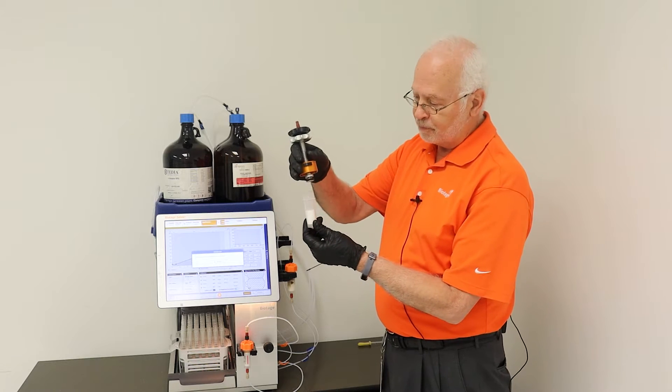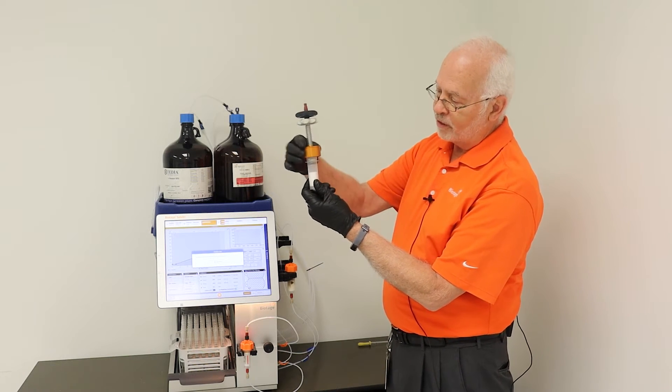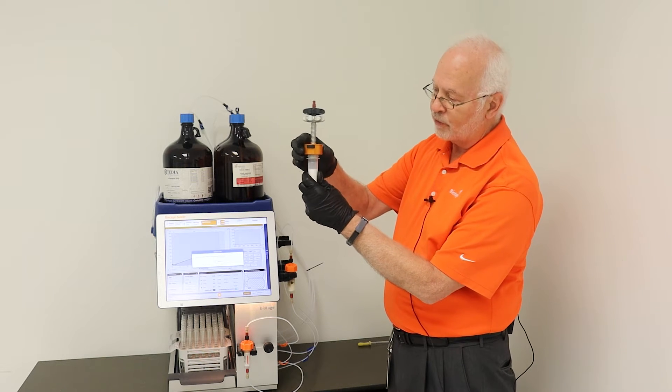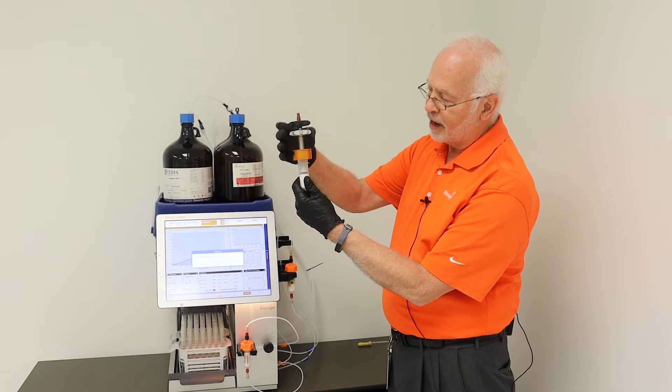You attach the plunger assembly by taking the gold part and attaching it to the top of the column, screwing that on, press this black button and it drops the piston down.